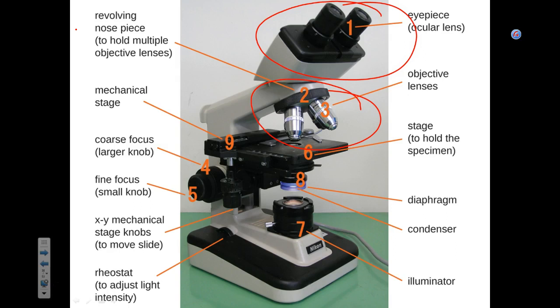Okay, I don't know, sacrifice an animal, pray, whatever your religion tells you to do, and then put some oil on the slide and slide this objective directly into the oil, so the oil makes a bridge between the slide that sits on the stage and the objective. You will see a little bridge. This bridge prevents light scattering and increases resolution of the image. And then you have to be super careful in bringing your image back to focus, okay? Just because it may not work.